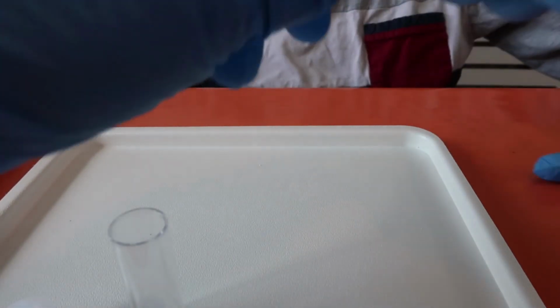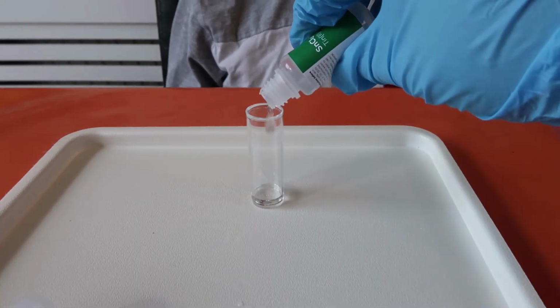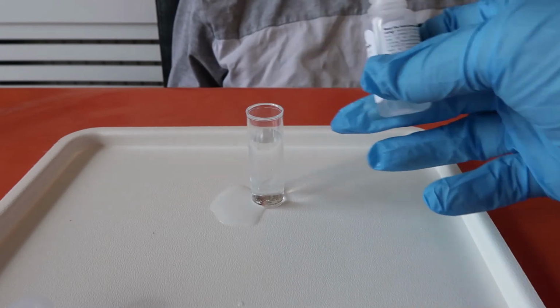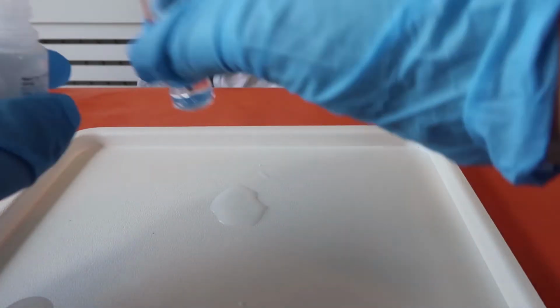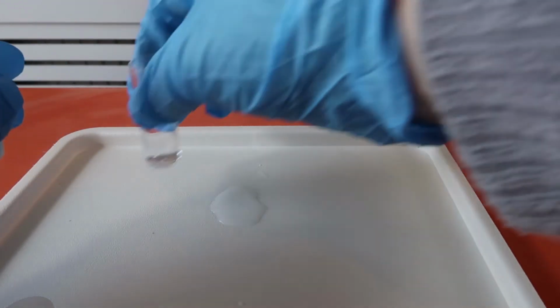So what we need to do now is open this, and pour half of it into there. That's right. Pour it to halfway. Let me know when it's about halfway, Oscar. Okay, it's halfway. Oh, oops. Let's pour a bit back. It's about halfway there, yeah?